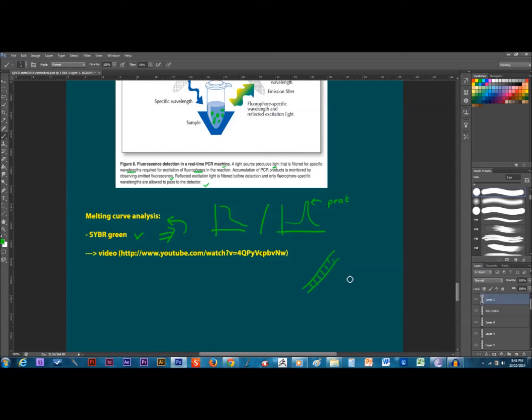So by using melting curve analysis, we can specify whether the amplified DNA is derived from our target DNA or from other sources, for example, primer dimers or any environmental contamination. So let's look at the video for the melting curve analysis.